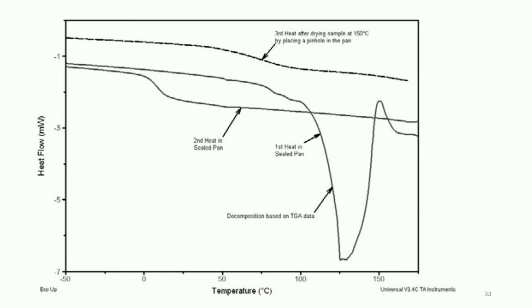As discussed earlier, the temperature of a glass transition decreases with increasing amount of moisture or solvents.